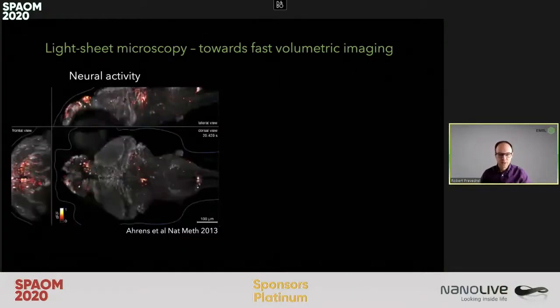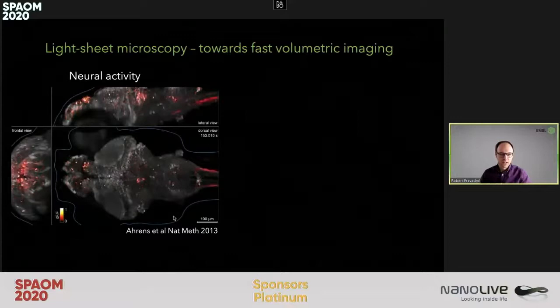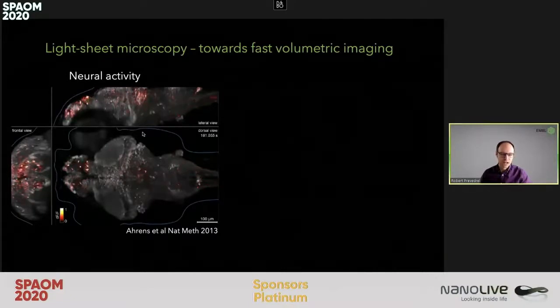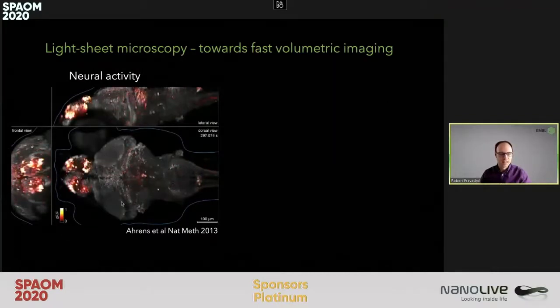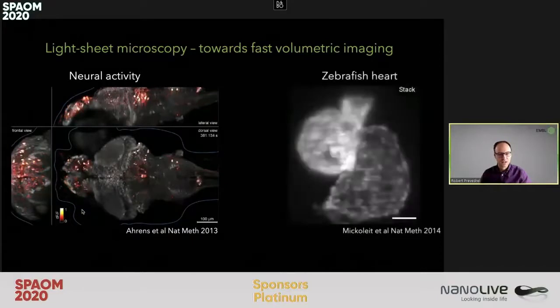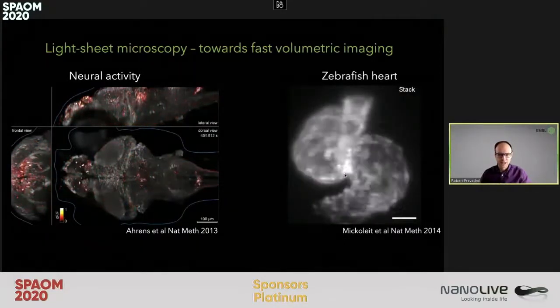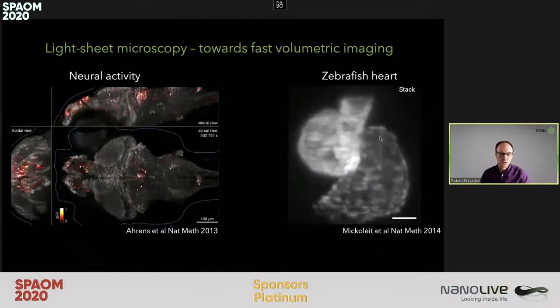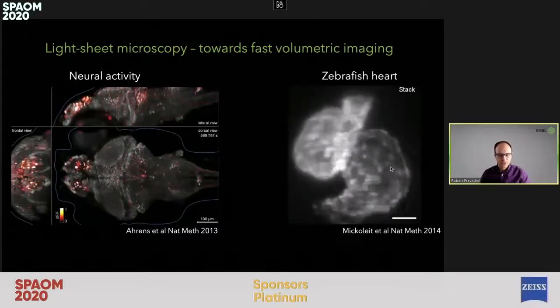This has enabled really beautiful experiments, such as the group of Misha Ahrens and Philip Keller showing for the first time that you can image the entire zebrafish larvae brain activity. And here on the right, beautiful experiments from the Huyskin Lab, where light sheet microscopy was used to image the beating heart of a zebrafish.